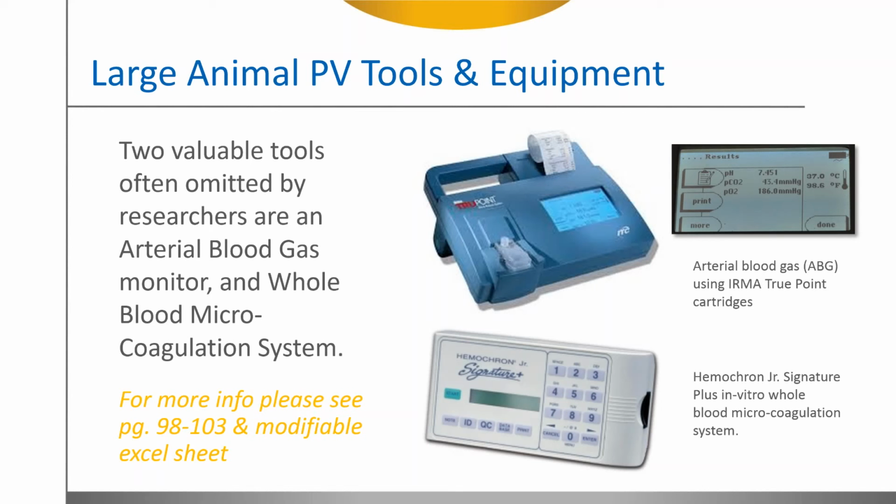For more information, Andy and I attached a downloadable Transonic modifiable Excel sheet. I call it supporting documentation for self-evaluation of final PV data. It contains examples of all equipment lineup, ready to go, enabling support of good PV work. It may serve as a modifiable checklist.